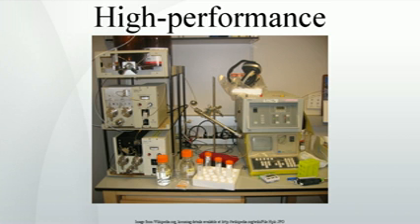Partition chromatography uses a retained solvent, on the surface or within the grains or fibers of an inert solid supporting matrix as with paper chromatography. Or it takes advantage of some Coulombic and/or hydrogen donor interaction with the stationary phase. Analyte molecules partition between a liquid stationary phase and the eluent. Just as in hydrophilic interaction chromatography, HILIC, a sub-technique within HPLC, this method separates analytes based on differences in their polarity.